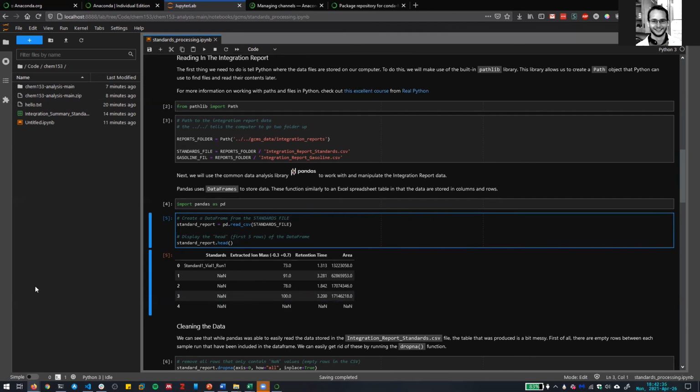The thing that's on the GitHub includes instructions for how to install this whole thing from scratch. But as long as you extract it within the environment that we just made, it should work as is. The code that I have on the main README tells you how to install it into a brand new environment, which you can do if you want, but this should be fine.